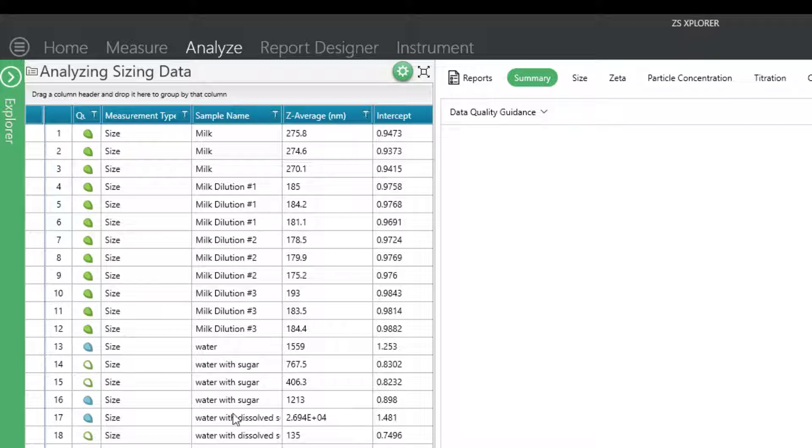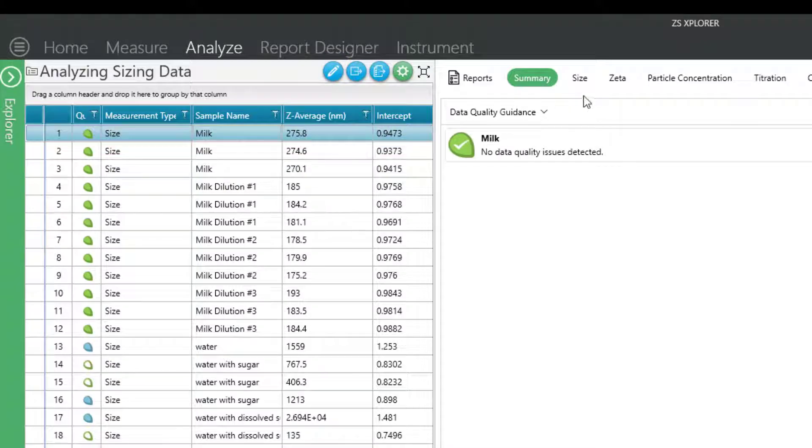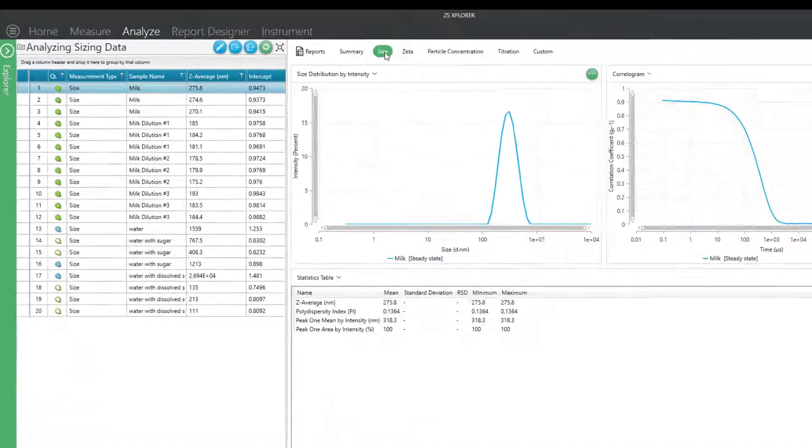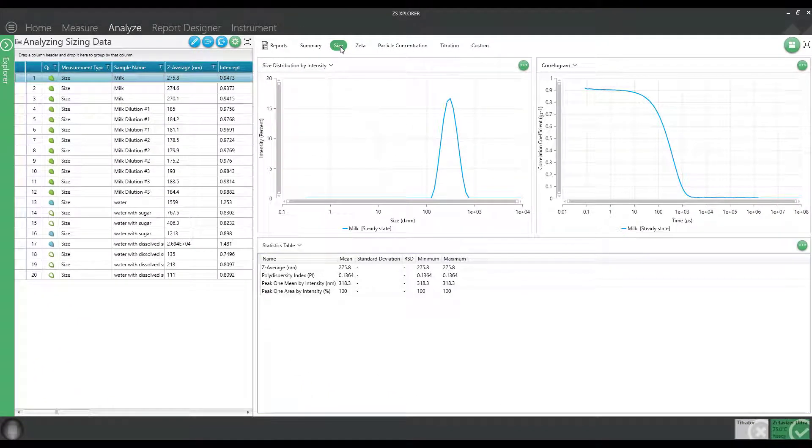For example, I started out with this milk sample, and if we navigate to the size window, you can see we get pretty decent results.